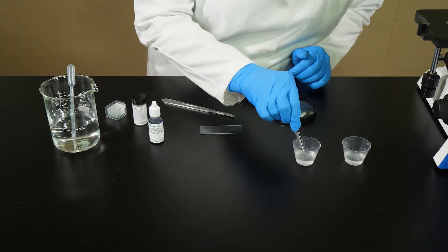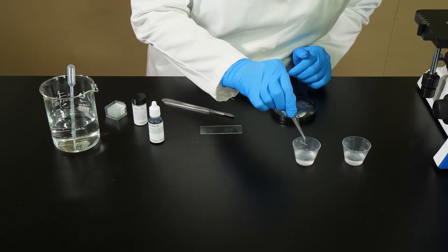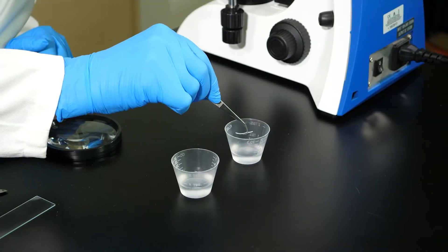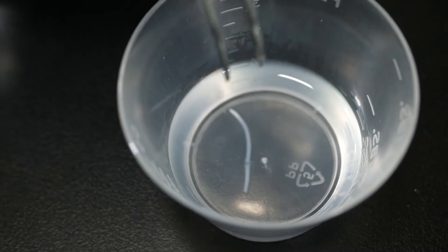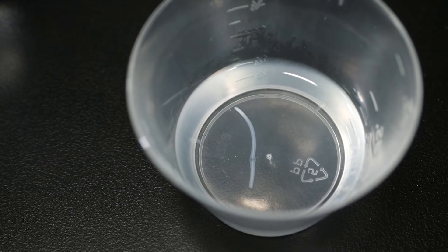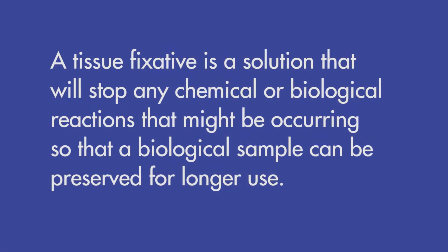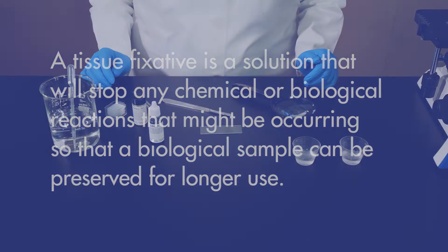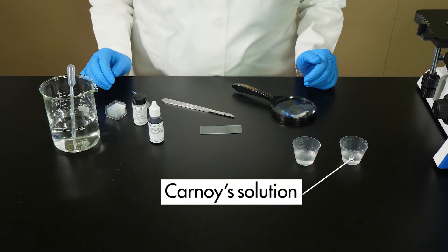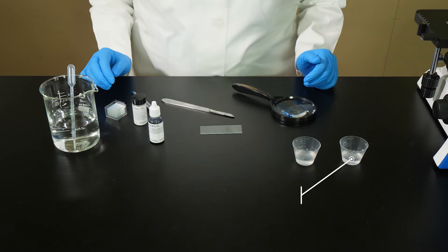After four minutes, we remove the sample from the hydrochloric acid and transfer it to a container with a tissue fixative. A tissue fixative is a solution that will stop any chemical or biological reactions that might be occurring, so that a biological sample can be preserved for longer use. The fixative we are using is Carnoy's solution. The onion root tip must soak in Carnoy's solution for four minutes.